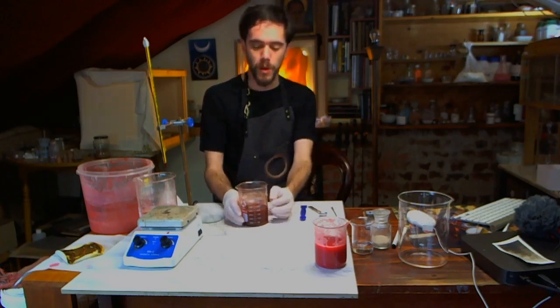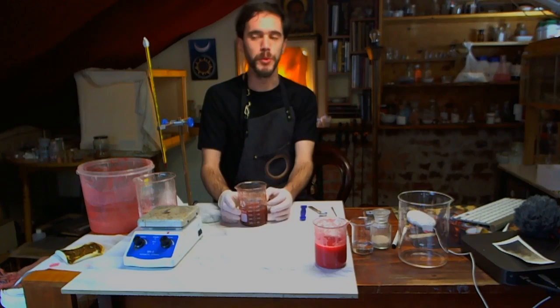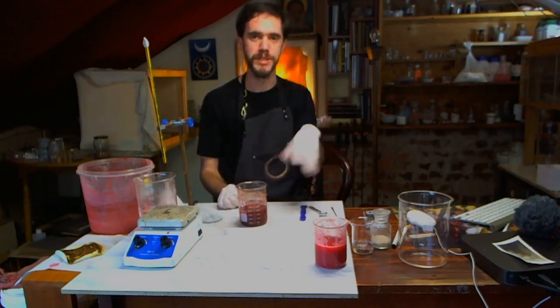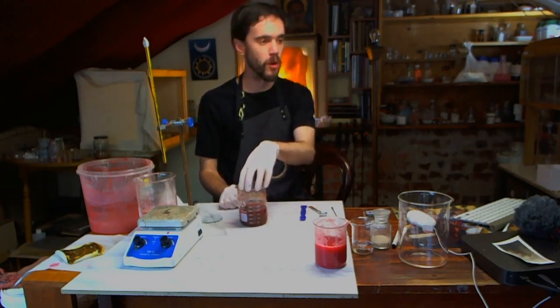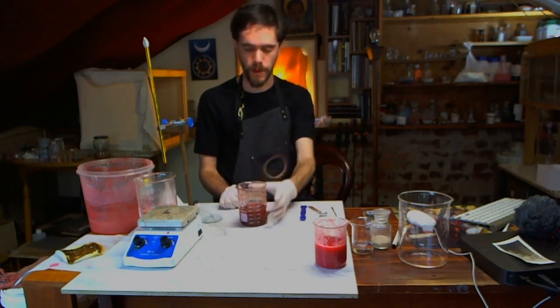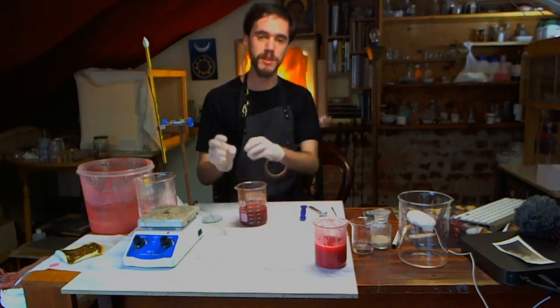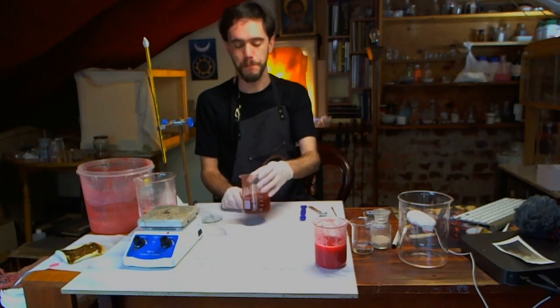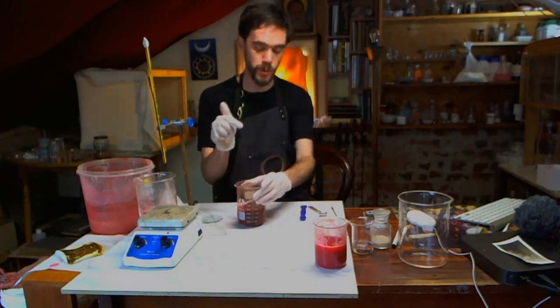So the idea was that by soaking it in sodium sulfate, we could extract unwanted material from the root material before doing the color extraction. Yeah, so the sodium sulfate was sort of like an additional purification step. But the next steps of this are actually really different, and I'm interested to see what happens, so we'll get into that in a moment.